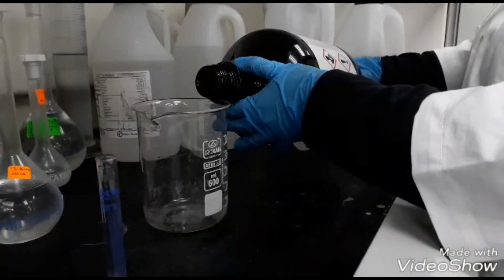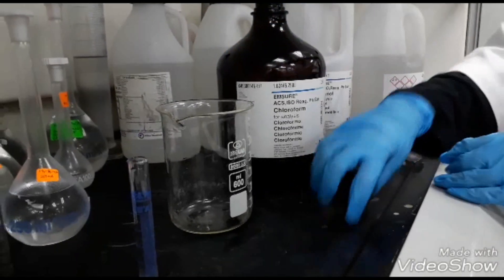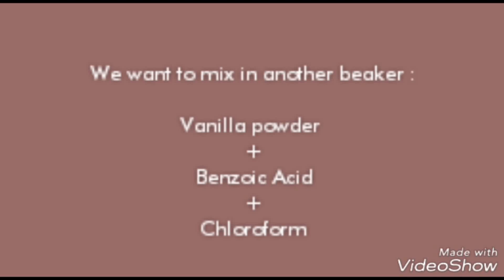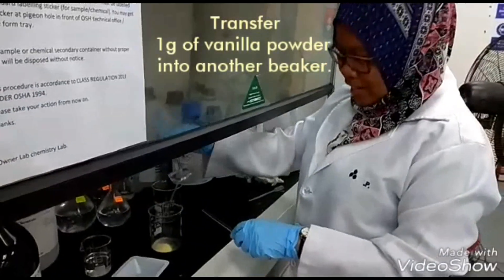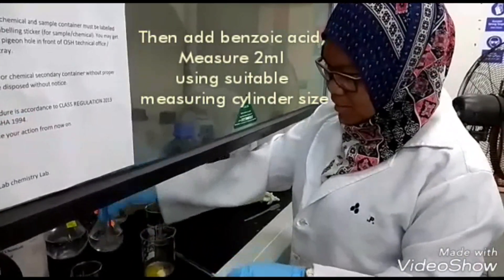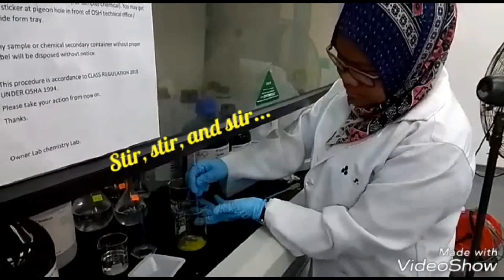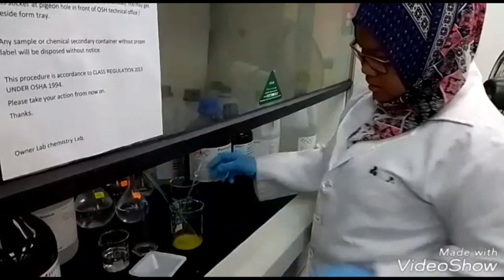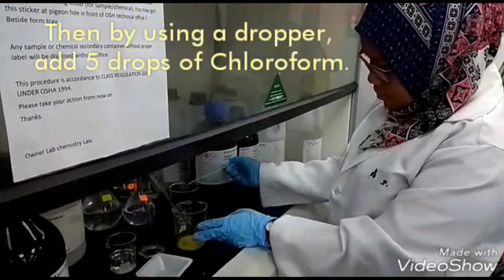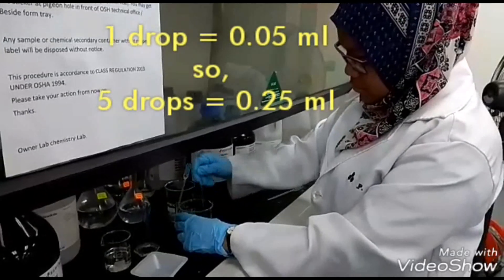The third step is we need to add 1 gram of aspartame with the dilution of the purified water.